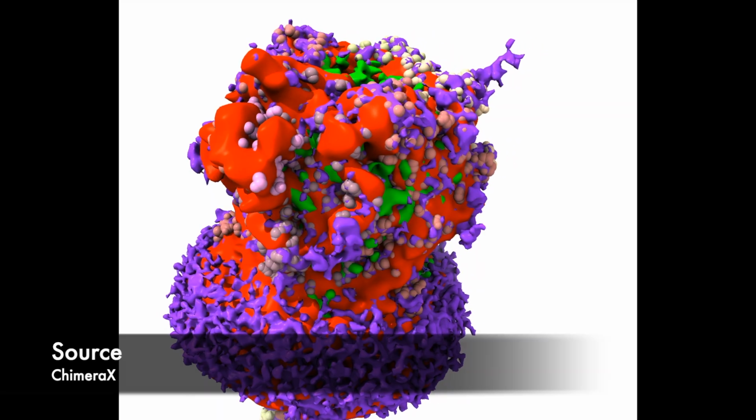That's what we're telling the program to do, just to focus on those areas to get a better understanding of what's going on there. Because we know that the toxin binds the receptor at the alpha gamma site, and it also binds in the pore. Those are why we have the focus mask there. So from the focus mask, we can look at the actual EM density maps they produce. So that's what we're looking at here.